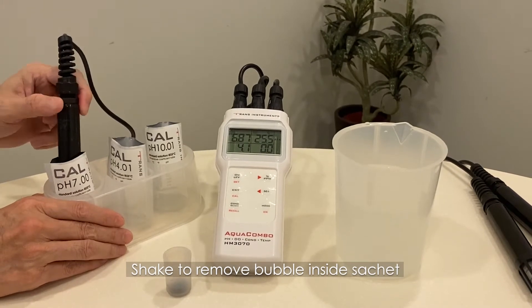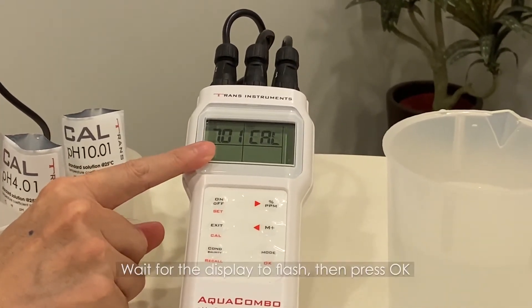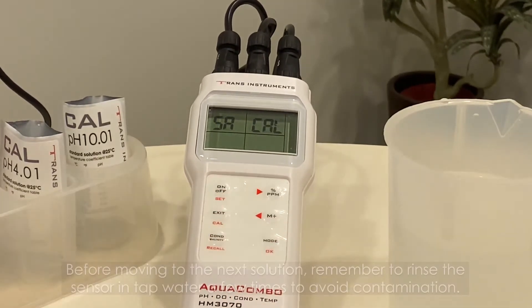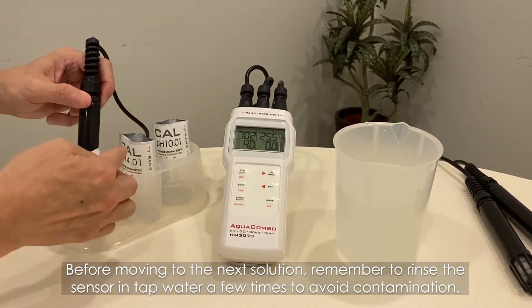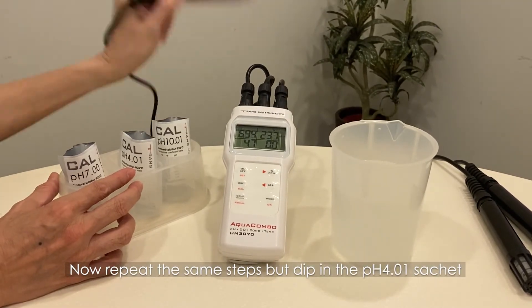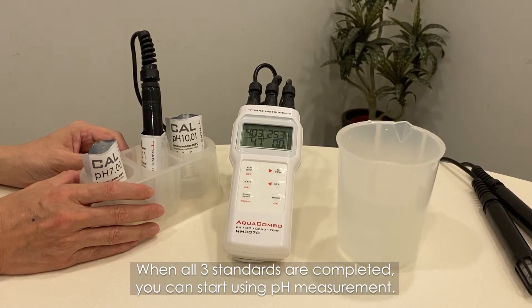Shake to remove bubbles inside the sachet. Press and hold the CAL button until the pH display is flashing and the CAL and temperature readings alternate on the right. Wait for the display to flash, then press OK. The display will show 'SA' momentarily, indicating calibration is completed. Before moving to the next solution, remember to rinse the sensor in tap water a few times to avoid contamination. Repeat the same steps for the pH 4.01 sachet. When all three standards are complete, you can start using the pH measurement.